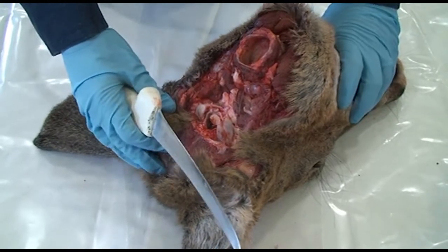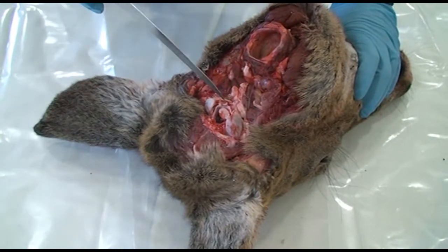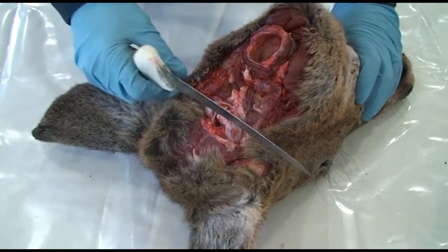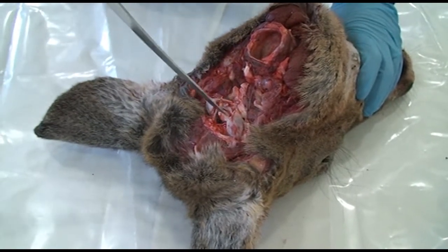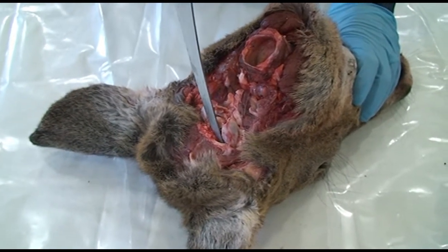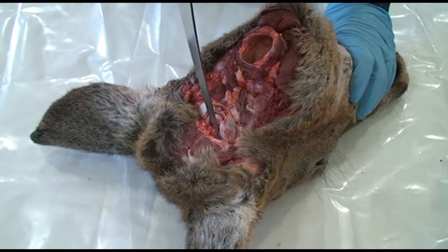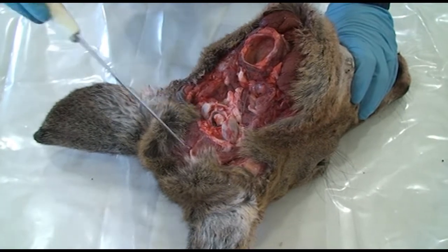But at this point, you don't want to just break the head off and tear and pull your joint open, because if you pull and tear that spinal cord, it'll sometimes tear or rip too far forward, and then you can't get it out. When you have this joint open, as soon as you can see your spinal cord and you can get in there, you angle your knife as far back toward the body of the deer as possible, and you cut that spinal cord. You put your knife right in there and cut right through, and that's what it should look like. You should see the cut portion of the spinal cord.